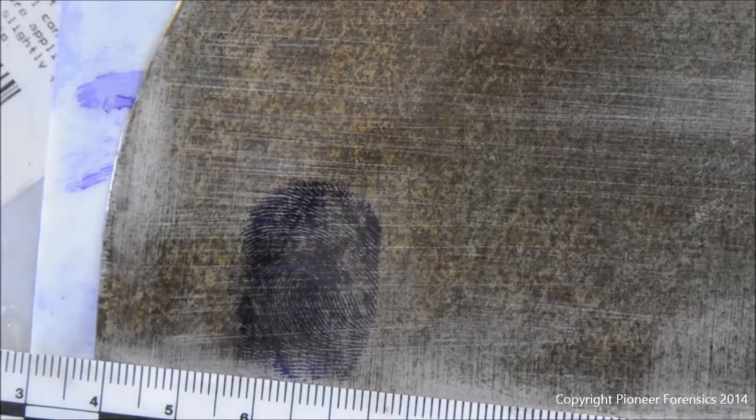If it's a tool mark, tool marks on clothing, if you need to develop and enhance it, LCV would be a great choice to use for your evidence development.